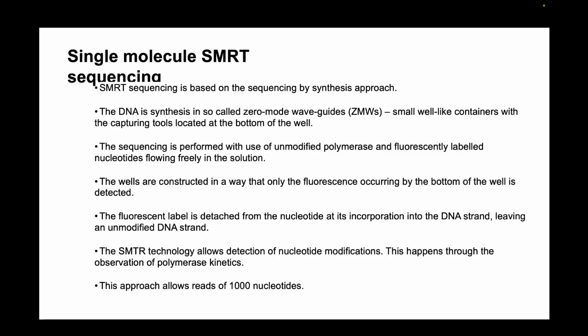Anyway, the usage of these kinds of special molecules is because you want some sort of signal telling you that that particular base has been added. That's all that you want. You can do it using fluorescence. You can do it using chemically modified NTPs as well. You can think of a number of ways to do it.